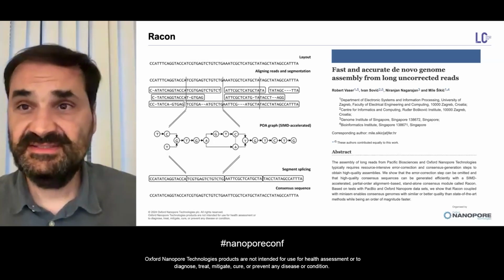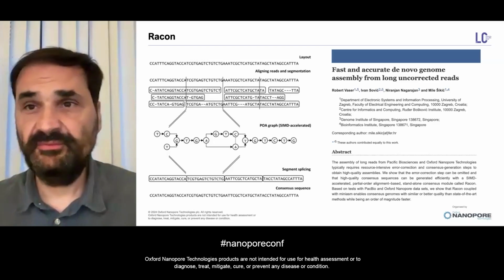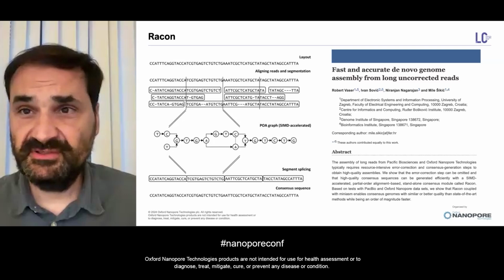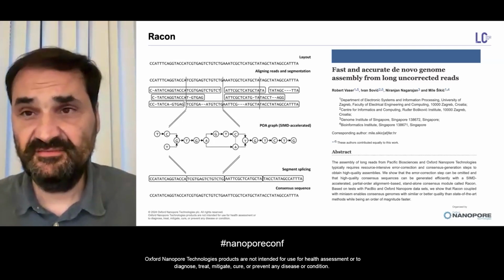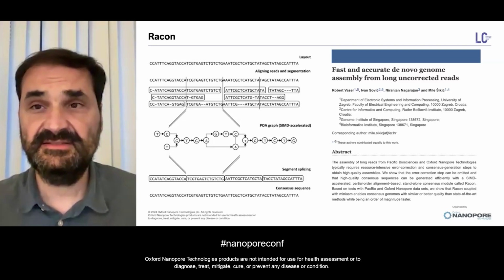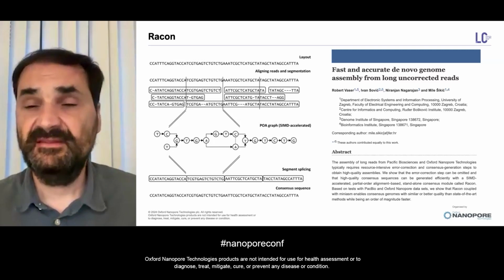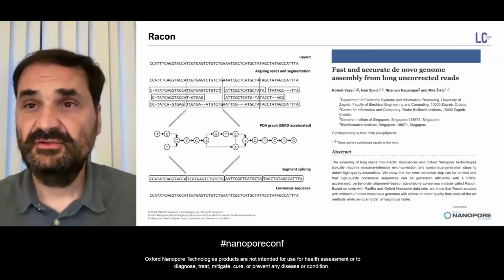That means that we need to correctly reconstruct all repeats. So if we have many segments in a repeat, we need to reconstruct all of them. To achieve this, assemblers use information from each of the segments because there are some teeny differences. So we would like to keep this information intact during the correction. The second thing is today we have phased genomes, and we would like to keep information which is important for phasing intact as well. So that was a new challenge, and we tried to achieve this.